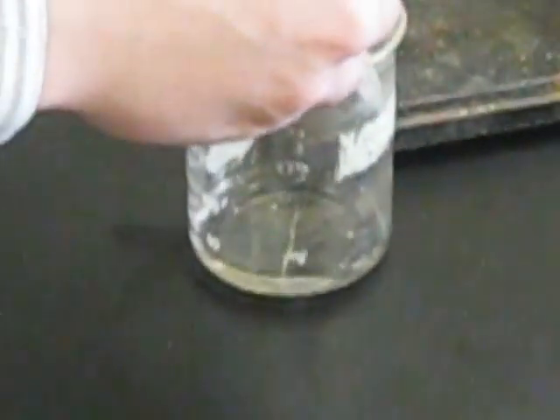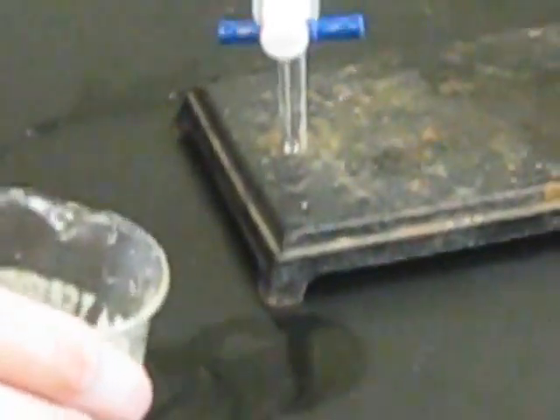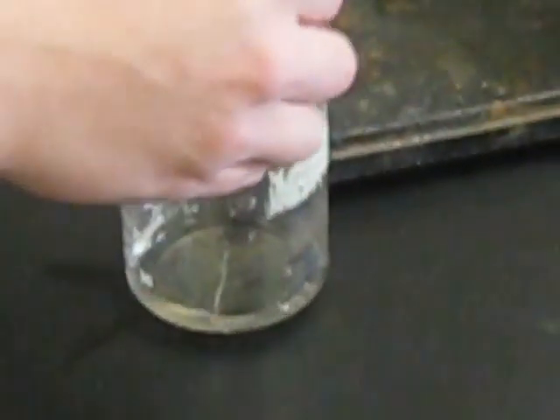Now, once that starts to happen, then we add 1 drop of base at a time until we get the color just right. And this process can take a little while. You want to be careful that you don't add too much base. That way we get an accurate reading at the end.